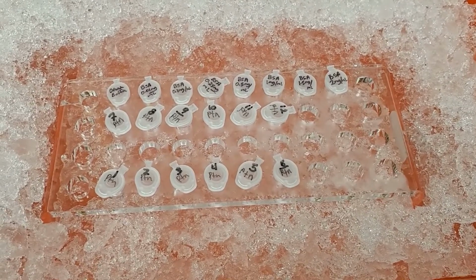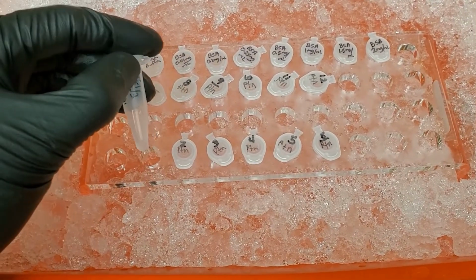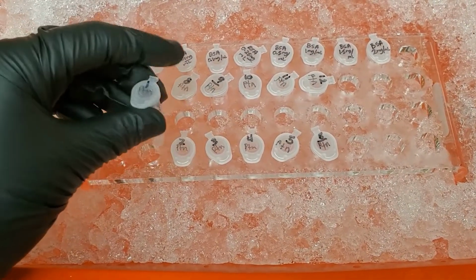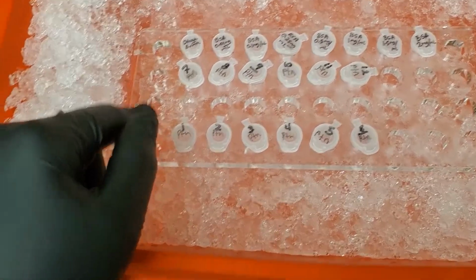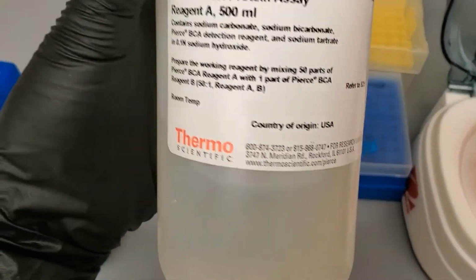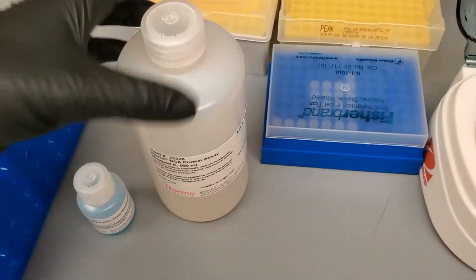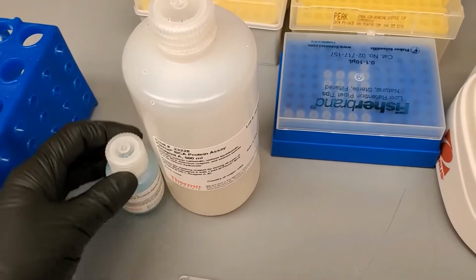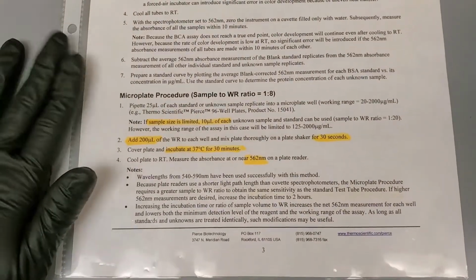Once the cell lysate has been collected and I have aliquoted a little bit for my protein assay, I start getting ready to do my protein assay. I'm using this Pierce BCA protein assay, and it comes with these two reagents that I'm going to mix together. And like everything else that you do, make sure that you have your protocol.